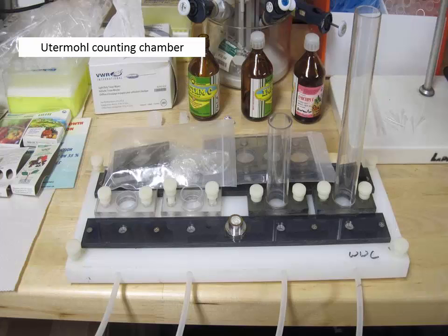While the Utermöhl chamber looks like this, this is one that I bought. You can buy them in various places. Some people make them for a living, and some places sell them like Ward's and Carolina Biological and so on. This one's on a platform and has levelers and a little sight bulb for making it level, because if you fill all of those chambers, here's a chamber, a chamber, a chamber, and a chamber, and if you don't have it level, then you're going to have different settling rates. And then you put a chamber on top of various sizes. So the biggest one would be about, I think this is 100 mils. This is probably 50, and then maybe 20, and then 5.